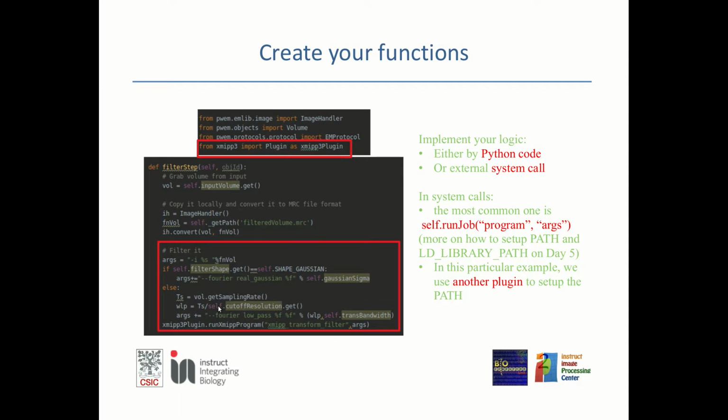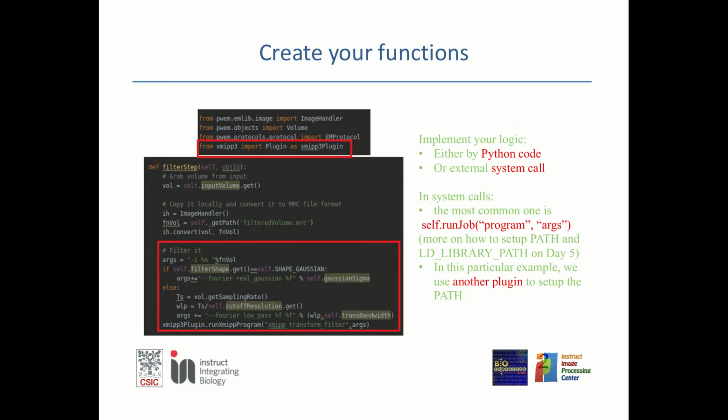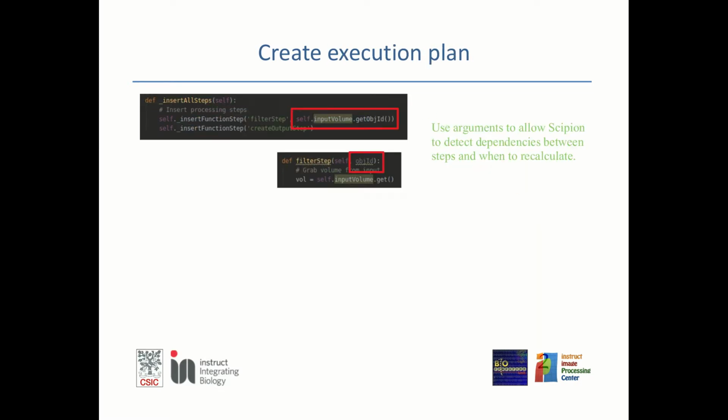So we have to distinguish between setting up the plan. The plan is simply constructing a graph of which function will be called after which, and this is real execution. So at this point, the file names and objects and even the directory associated to the execution doesn't exist.